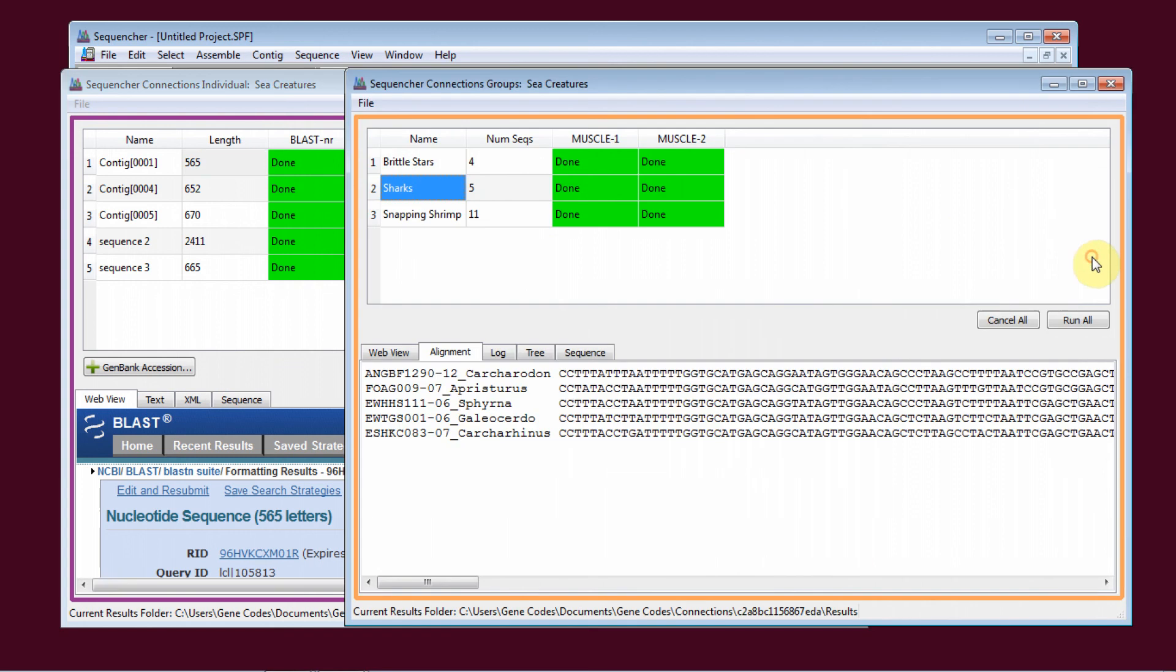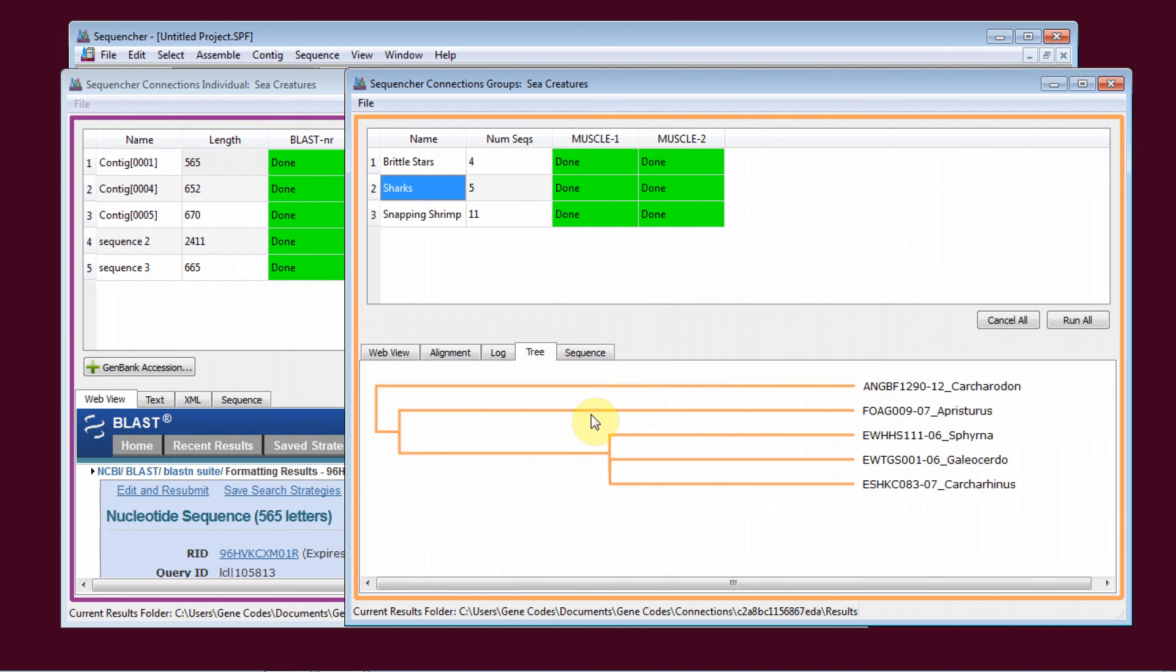For groups of sequences, you can run MUSCLE alignments and view the results as the aligned sequences or as a phylogram.